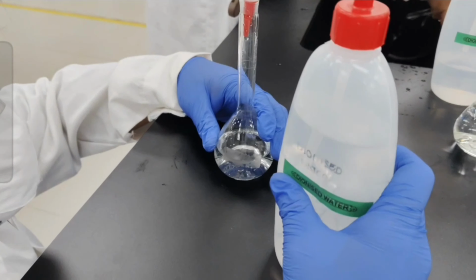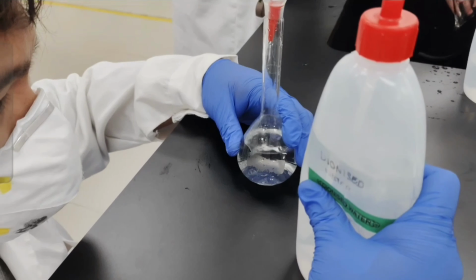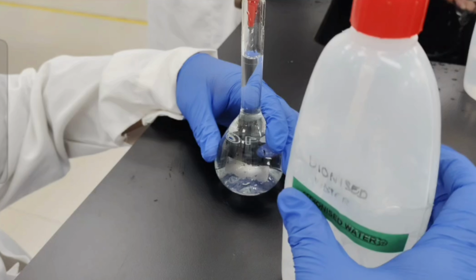Then we fill the volumetric flask with deionized water until it reaches the mark. After that, we close the volumetric flask and shake well to get homogeneity.